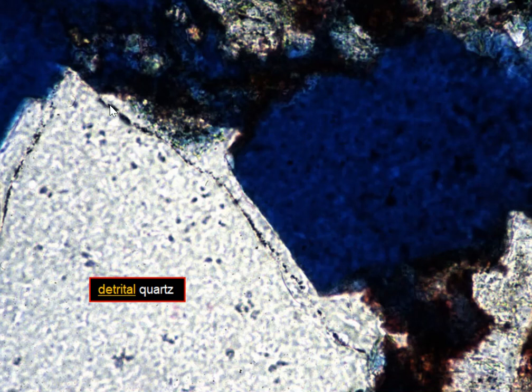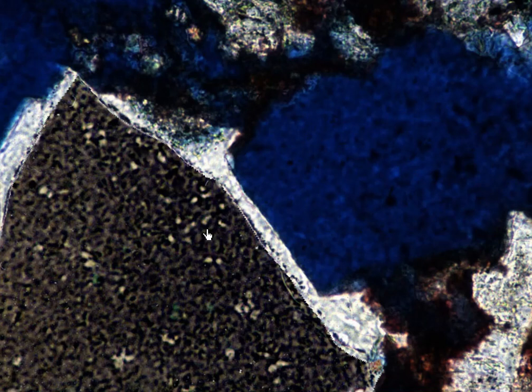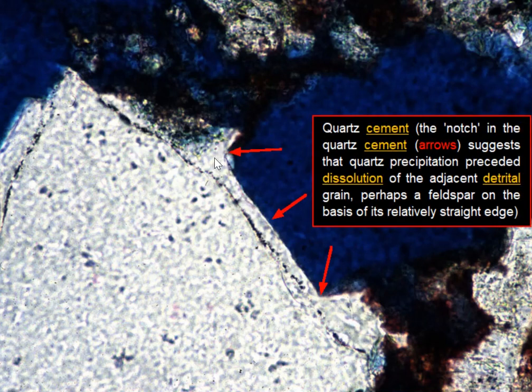Detrital quartz, take a look. Take a look at that. Why did they draw the boundary of that detrital quartz there? What does that mean about this? Ha, quartz cement.